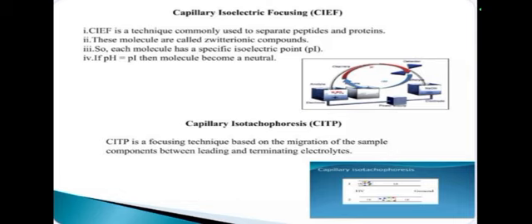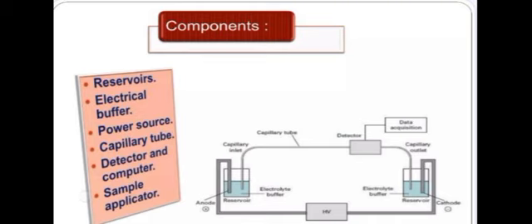Last mode, capillary isotachophoresis, CITP. It is a focusing technique based on the separation of sample components between leading and terminating electrolytes.